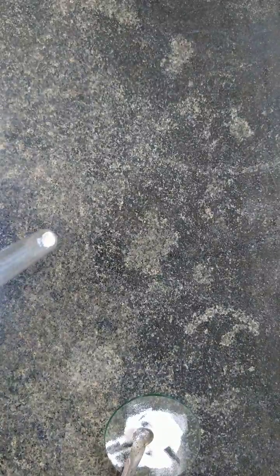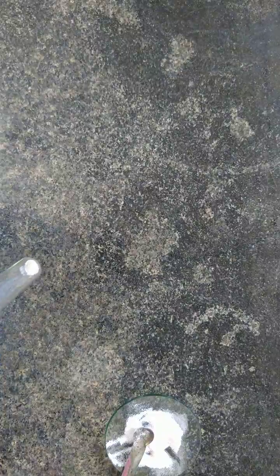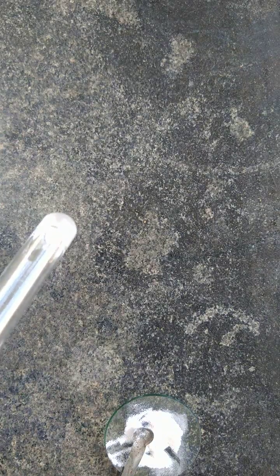What we are going to do here is, in a test tube we take a small quantity of salt. To this we add dilute sulfuric acid. Here you can see the reagent bottle containing the dilute sulfuric acid. So look at the observation. After adding dilute sulfuric acid to the given salt, there is no action. We are not getting any brisk effervescence. So the observation is no action. So group 1 is absent.